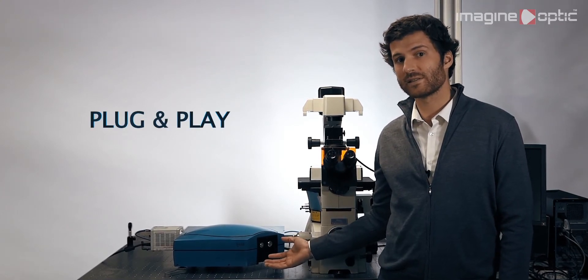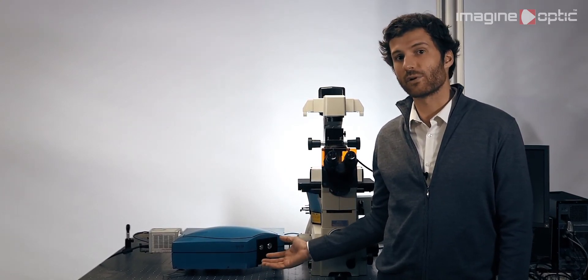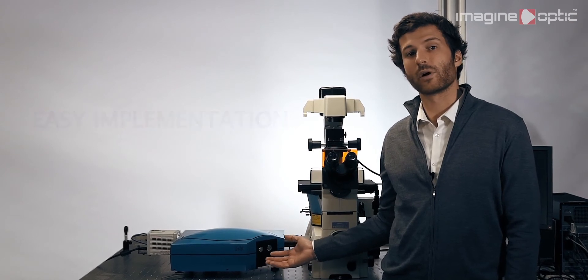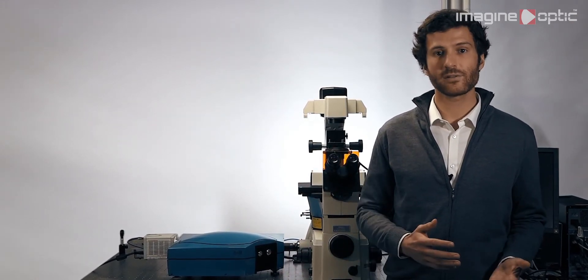Mikao is the first plug-and-play adaptive optics system, and it was designed for easy implementation on inverted frame microscopes. It is compatible with 60x and 100x objectives, both CMOS and EMCCD cameras.